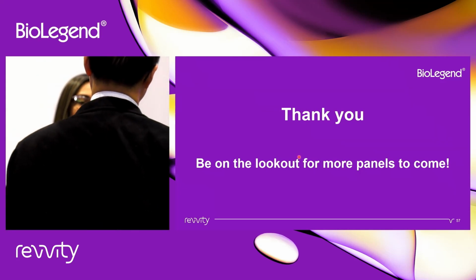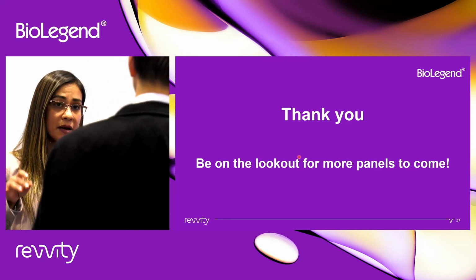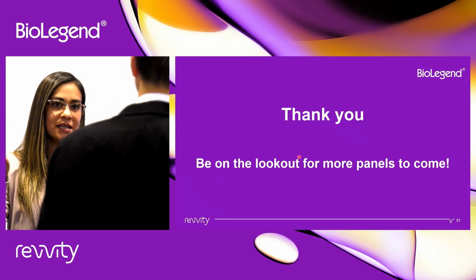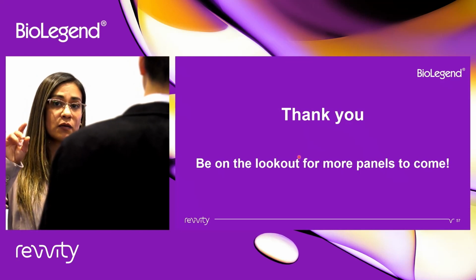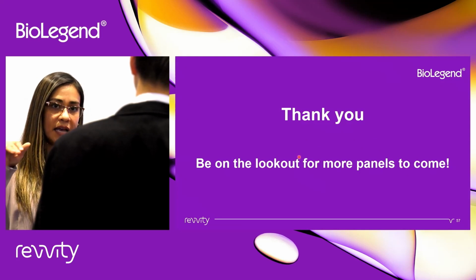Yeah, I think for our human general phenotyping panel, you can distinguish them very well. And also your gating strategy is going to help you to distinguish what signal is coming from the B cells versus the T cells. When you do the unmixing, we can observe a very good resolution for both if you gate them against each other.